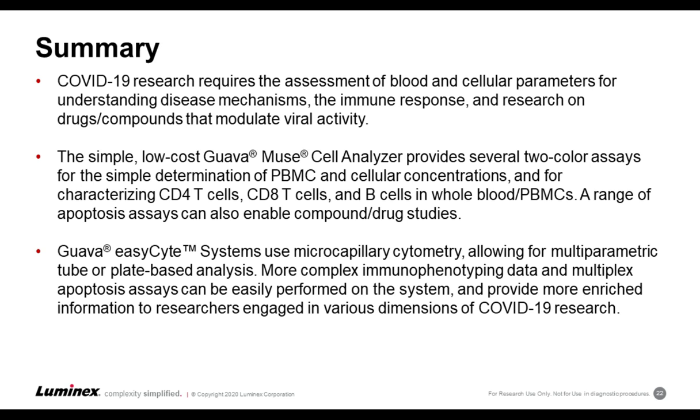To summarize, COVID-19 research requires the assessment of blood and cellular parameters for understanding disease mechanisms, the immune response, and research on drugs or compounds that modulate viral activity.